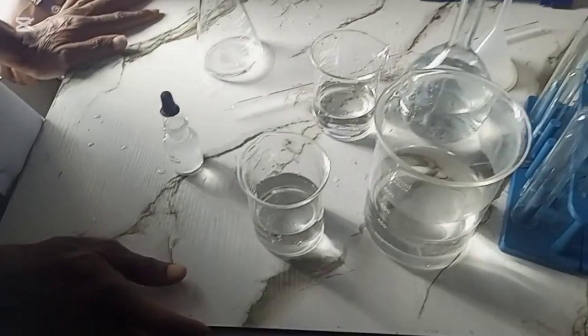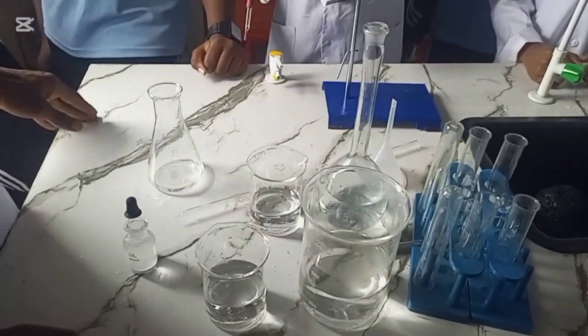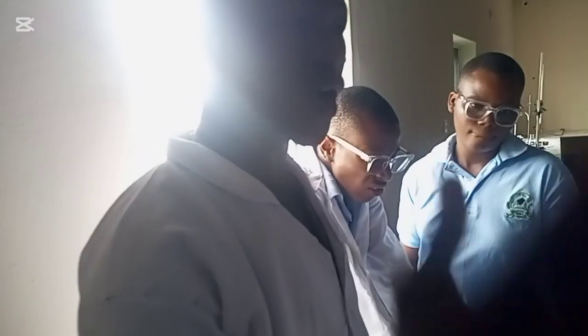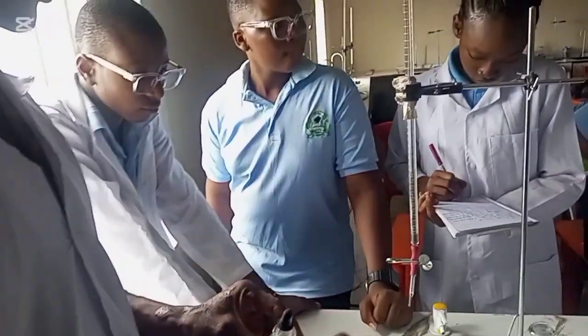This indicator, you don't just choose the one you use. Rather, you use the indicator based on what you are doing. We are doing titration between a strong acid and a strong base. We also see types of acid, weak bases, and weak acids, which are usually organic acids.